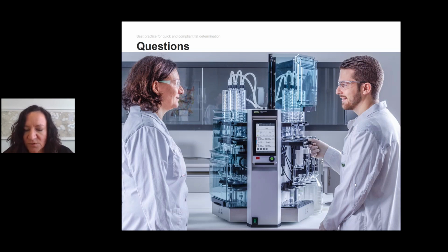What kind of celite should we use during hydrolysis? Actually, there are many different celite qualities and particle sizes. We recommend to use, I hope I'm not mistaken, the 545. We also tested different manufacturers, and we recommend to order the celite from BUCHI. You can order it directly from us with the celite quality that we found to be the best one for the acid hydrolysis and for this purpose.